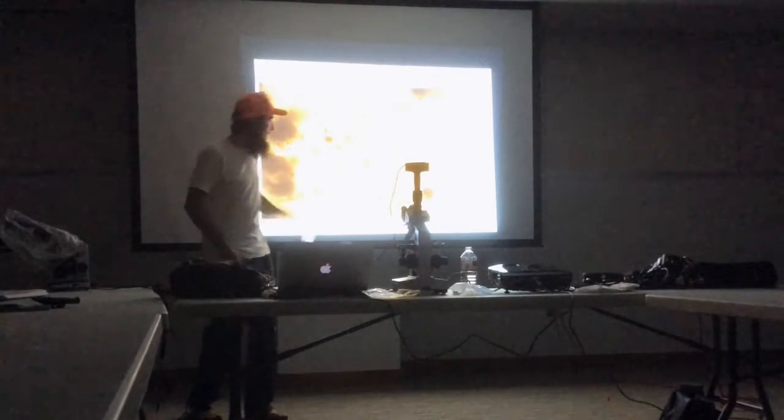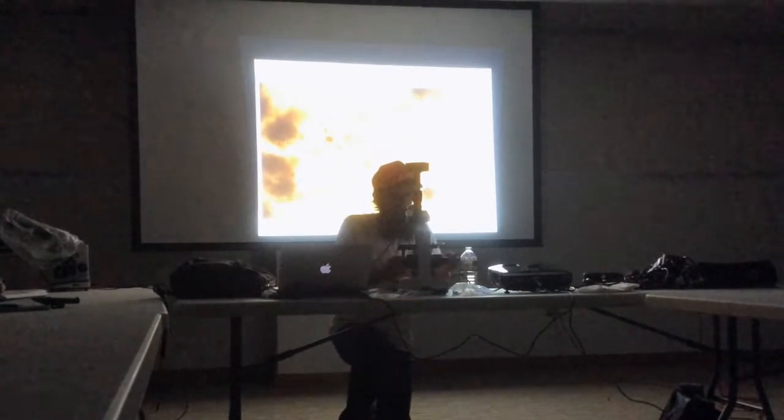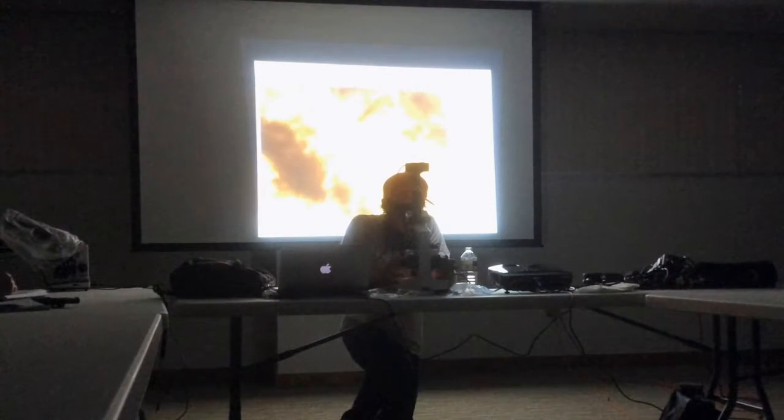So I haven't seen any active stuff on here yet, or any larger life, but good fungus so far. I'll go to one last random spot.